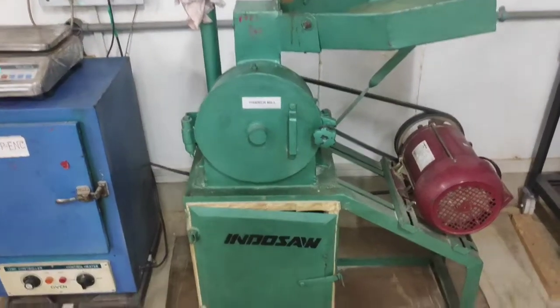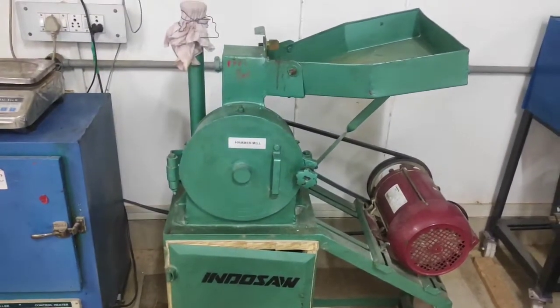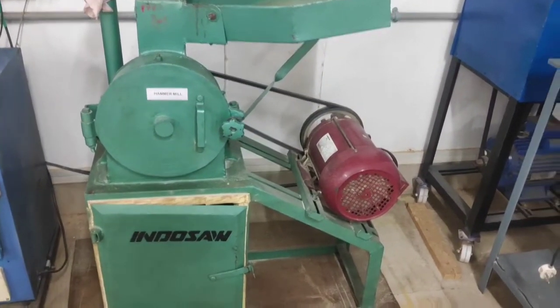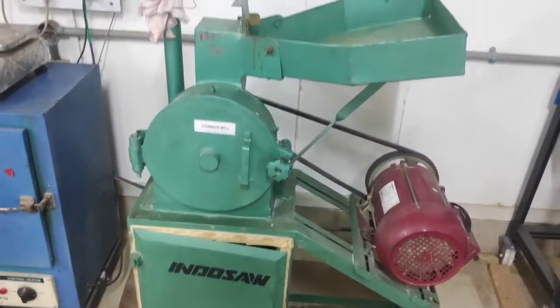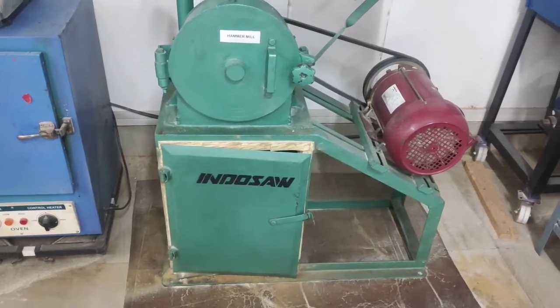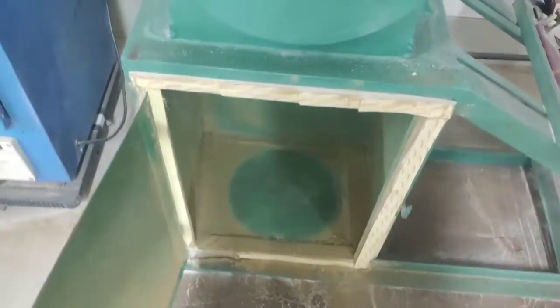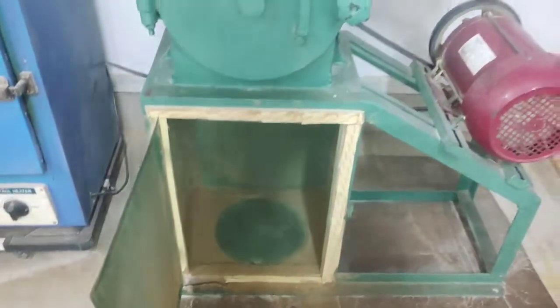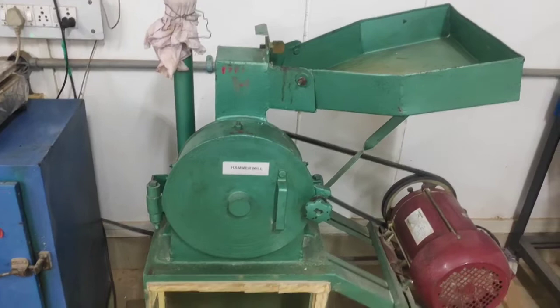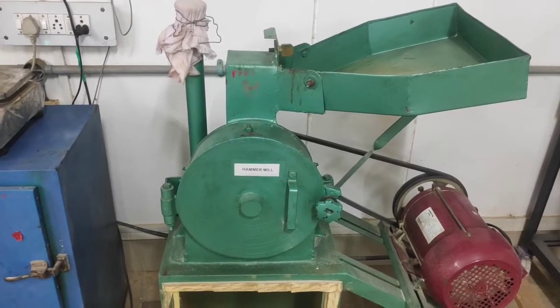Thus we have completed the milling using a hammer mill and obtained a very fine powder. Now let us clean the machine using a brush so that it is clean for the next use. The disadvantage of using a hammer mill is that it consumes high energy and requires high power to break down hard materials such as fenugreek seeds, turmeric, or other spices. The efficiency, capacity and power requirement for the hammer mill can be calculated from the prescribed formulae.